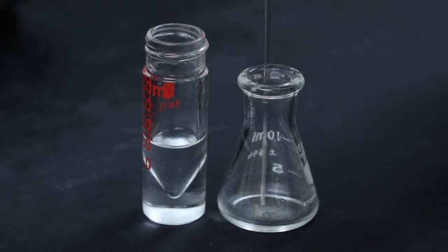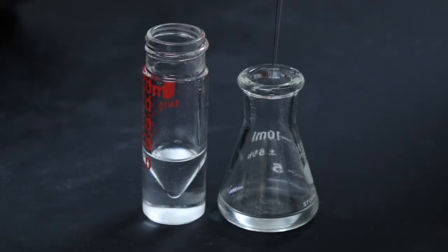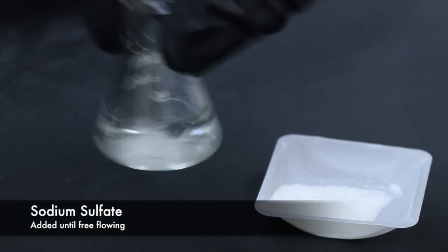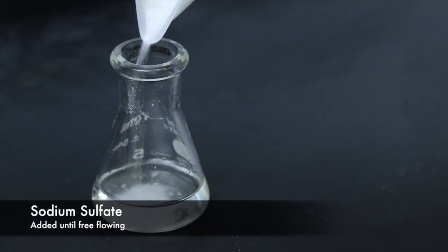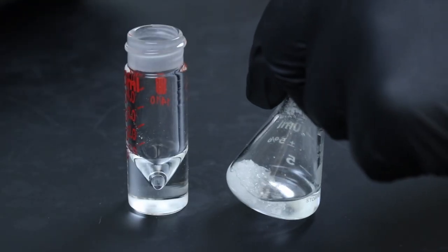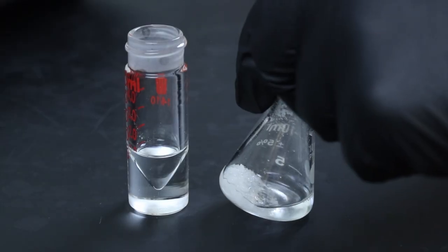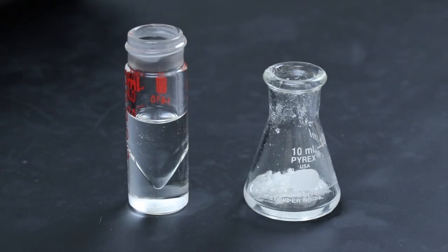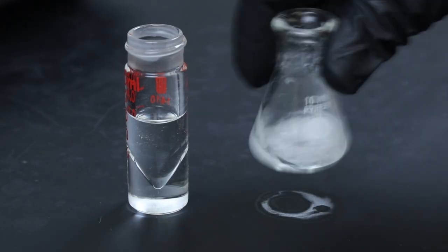Now I'll move the ether solution over to an Erlenmeyer flask, where I can dry it using sodium sulfate, and I'll add that until it is free flowing. Once it is free flowing, I can remove the solution from the Erlenmeyer flask, and then to reclaim more product from the sodium sulfate, I'll go ahead and rinse that again with some more diethyl ether.